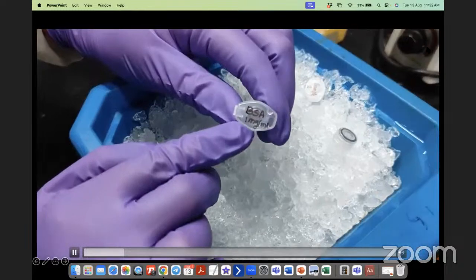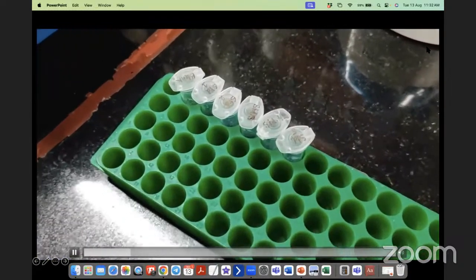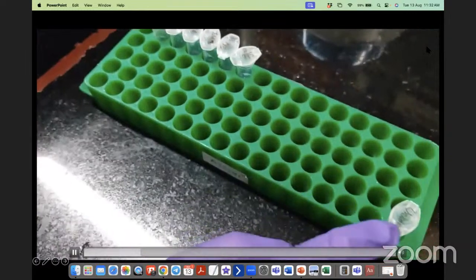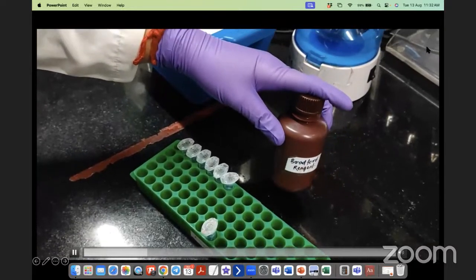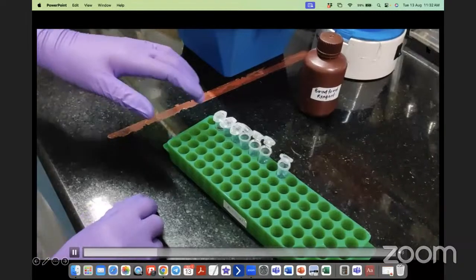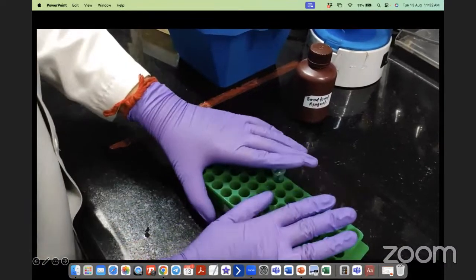Before performing the assay, firstly, we should have a standard protein. The standard protein here we are using is bovine serum albumin, that is BSA. So here we have prepared serial dilutions of BSA, that is standard 1 to standard 5. And also one blank, which will involve only the reagent. And here we have one unknown sample. Now, to each of the tubes, an equal volume of Bradford reagent is added. After addition of reagent, the tubes should be kept in dark for 5 to 10 minutes.